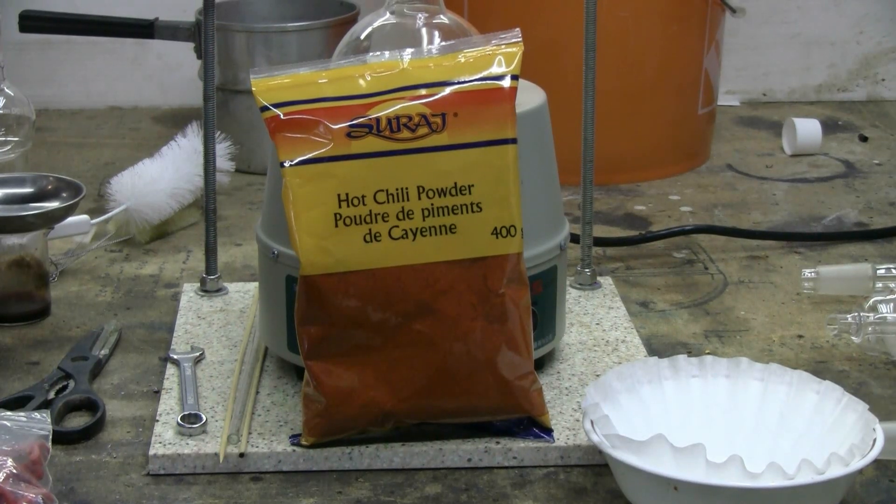Today I'm going to try a Soxhlet extraction using ethanol as the solvent on this prepared hot chili powder from the grocery store. According to its label it only contains ground chili peppers that are supposed to be hot. I'd like to see what kind of extract I get from this stuff. I've already done an extract of ghost peppers, so obviously this won't be anywhere near as strong as the ghost pepper stuff, but it should be interesting.